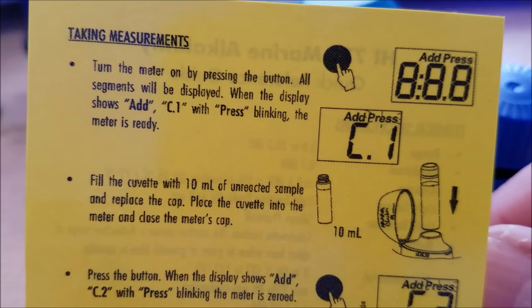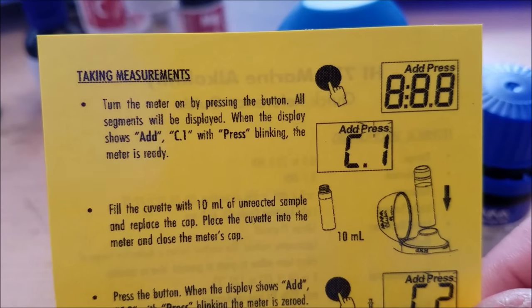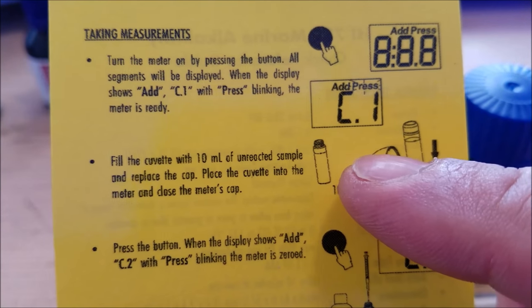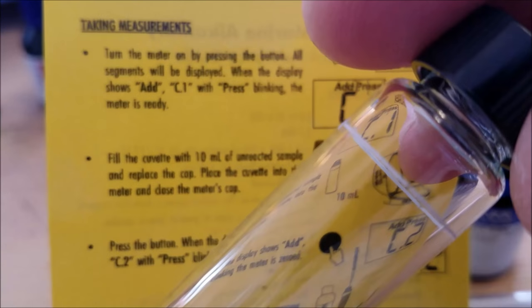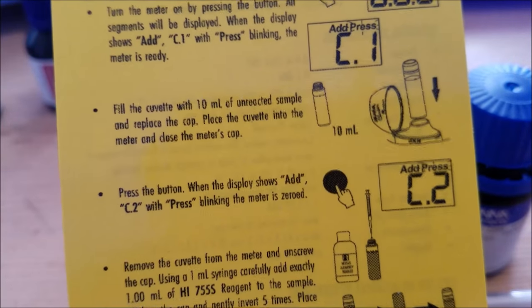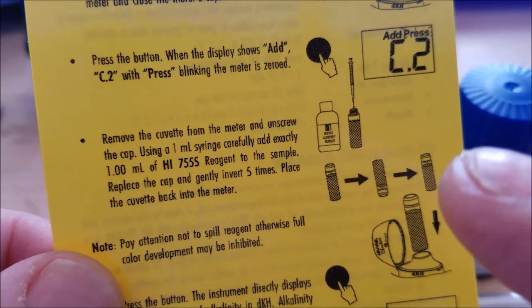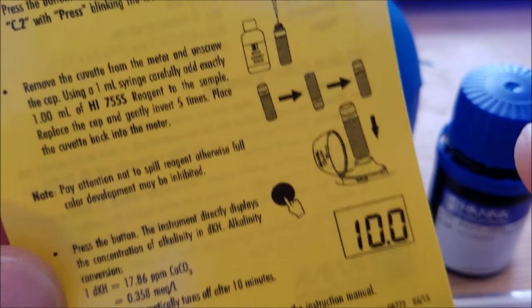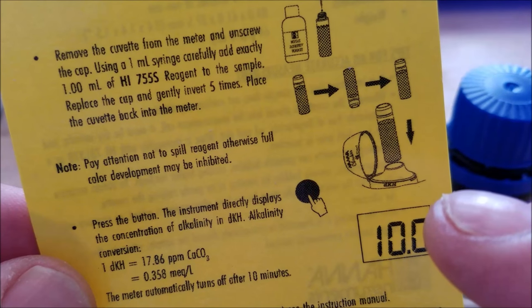Here's the Hanna Checker Alkalinity and the quick reference card that comes with it. First, you turn on the meter until it says 'add C1.' Then you fill a cuvette — the glass vial that comes with it — with water up to the line. You put that into the Hanna Checker and press the button. It will then say 'add C2,' and you add one milliliter of reagent.